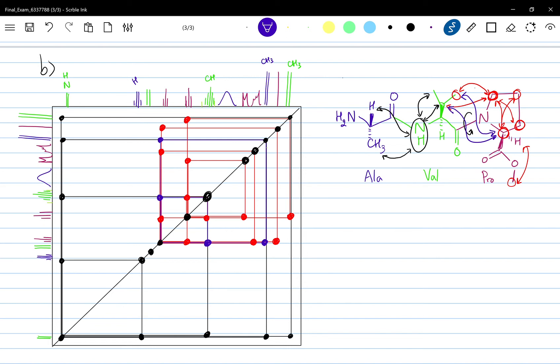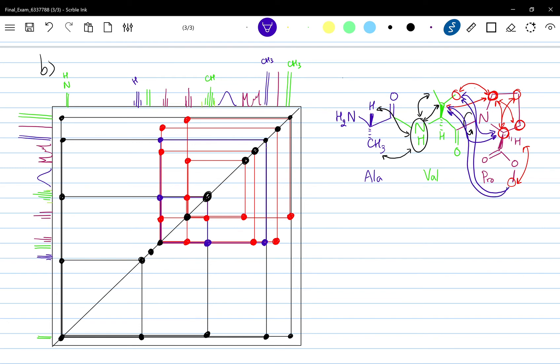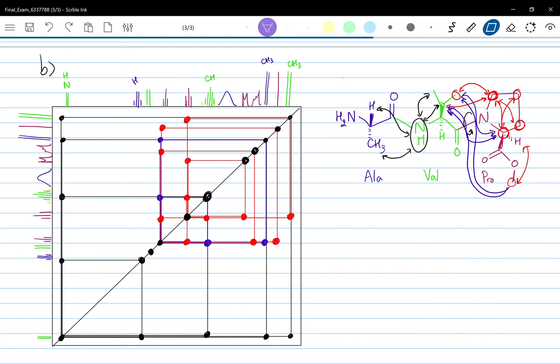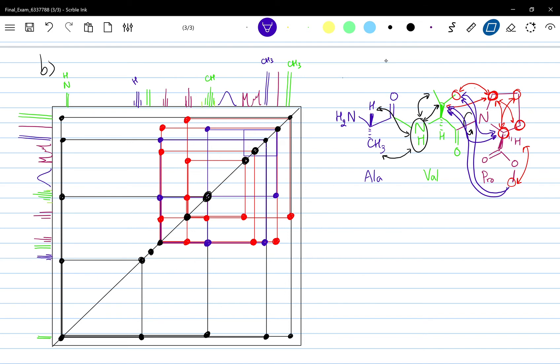Before we forget, if we rotate it another way, this methyl — the red one — can also see both of them. This methyl can see both the septet and this doublet. That might be quite confusing right now, but we still have some more interactions to go through.